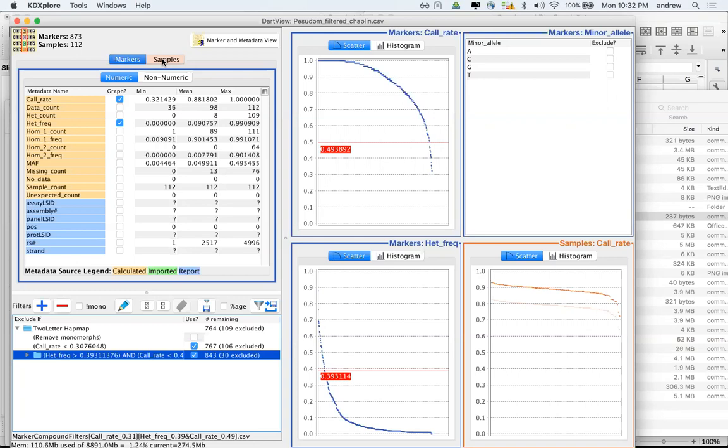Andrew, we've had that feedback from a few people, that even if you import in the 2-row format from Dart, if you could export as a HapMap, to have the flexibility to export in different formats would be really good. Yeah, it definitely would provide more versatility in the downstream analysis.